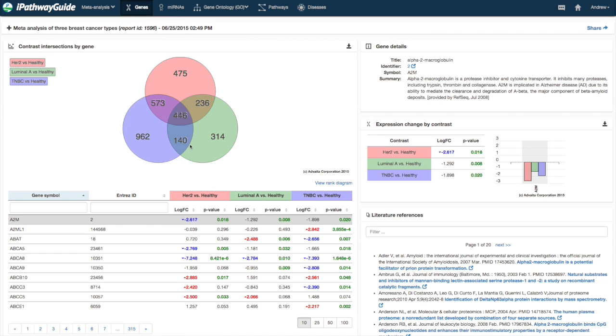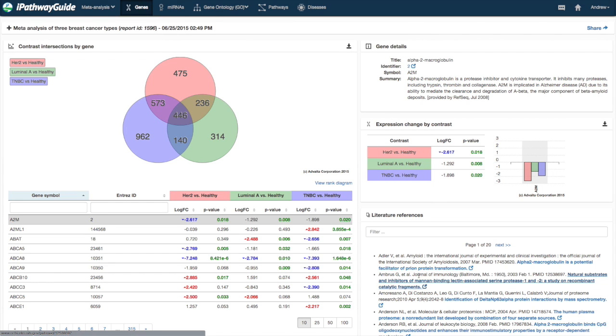The layout consists of a Venn diagram, data table, information on the selected entity, information about the gene expression for the significant differentially expressed genes across each contrast, and associated literature references.